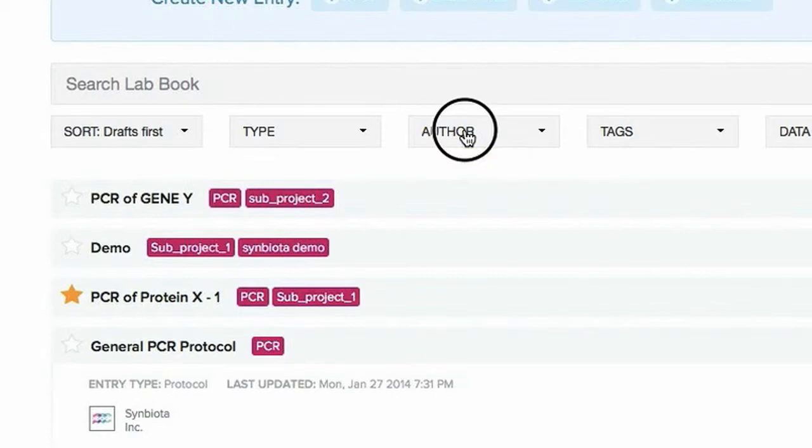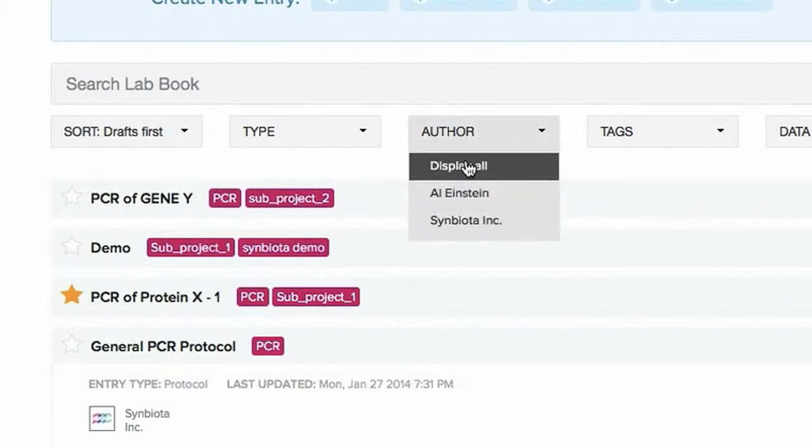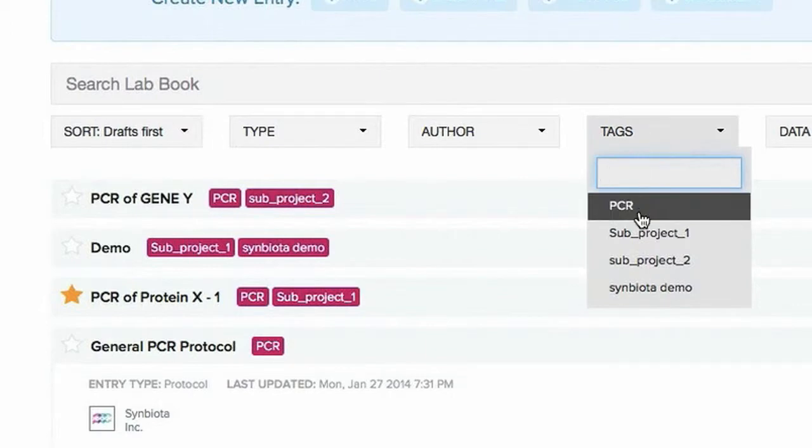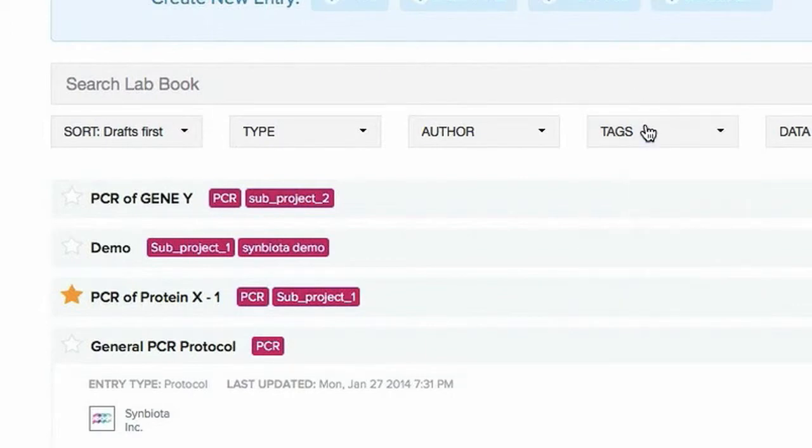You can sort by your collaborator. You can sort by tags. And you can sort by data type.